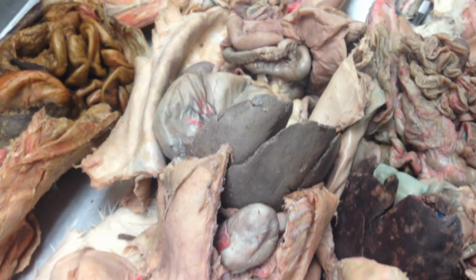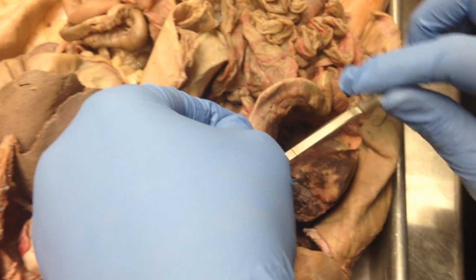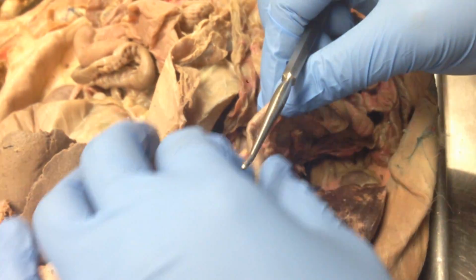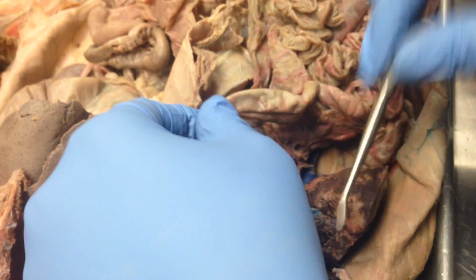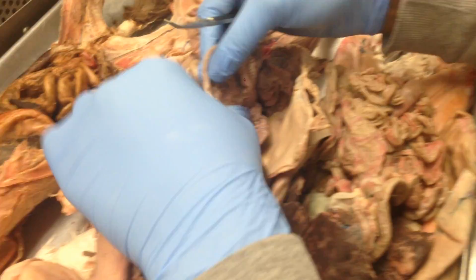And then the duodenum and mesoduodenum. The duodenum is this, the top part of the intestine. The mesoduodenum is usually in the mesentery, so it would be underneath the duodenum. Okay.